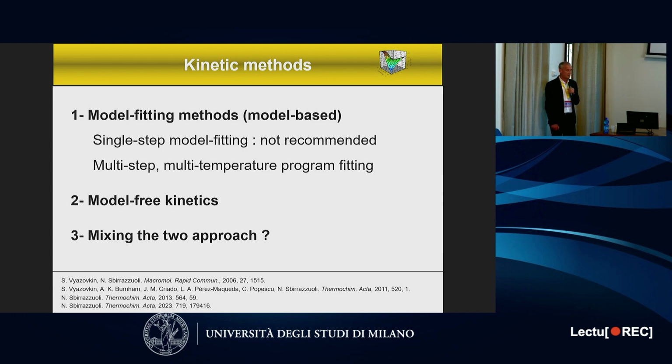But at that time, the computers were limited, which is not the case now. So we have the model-based. The model-free kinetics, maybe you know a little about this approach, is completely different. And I will show you today that we also try to show that mixing the two approaches can be very interesting.